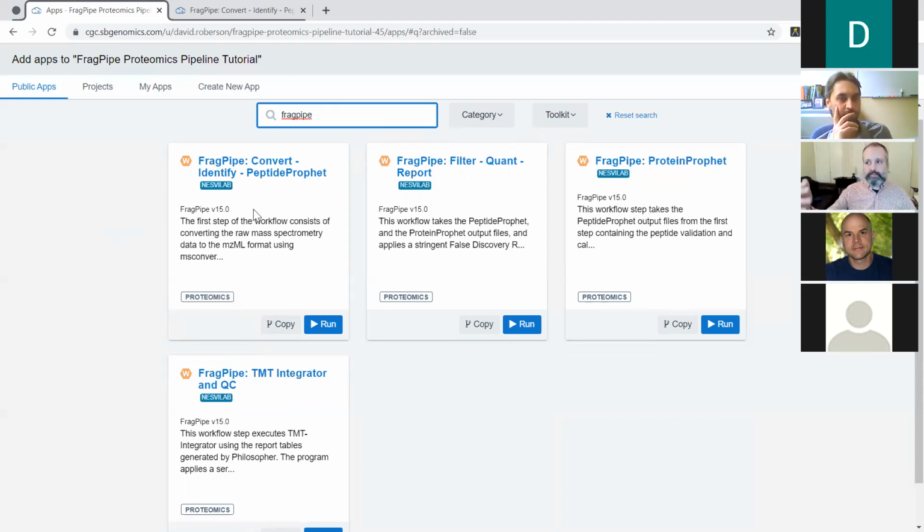So we're going to be always updating. Felipe and I are going to make sure that these get updated as we get feedback from you. So please provide feedback on the GitHub website about, I really wish the app could do this, or I saw a bug that's not quite right. Let us know, because Felipe did what's called third-party publishing. So we actually created these wrappers and then pushed them to the public apps gallery. So that's available to any of our collaborators that want to do this. And that's why you get this icon here, that it's coming from an external party.